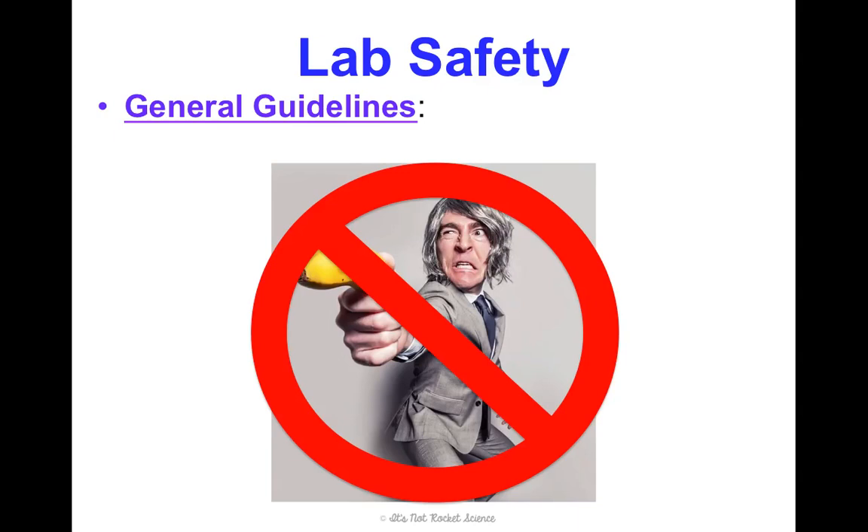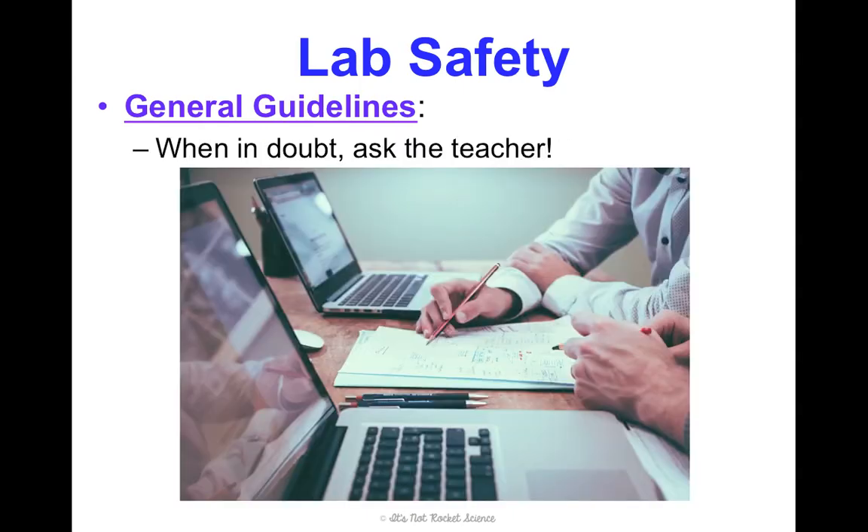This is not how we should be acting in lab at all. We need to take labs seriously — never goof around. About 90% of the injuries or broken instruments that have ever happened in my class have been because someone was messing around. When in doubt, ask me. I don't want to baby you through the whole process, but please ask questions before you assume something and end up making a mistake that could be dangerous.